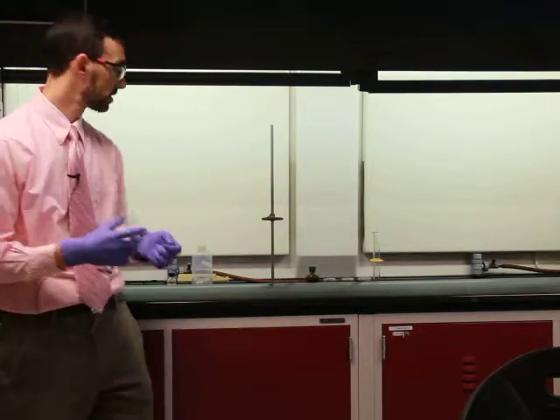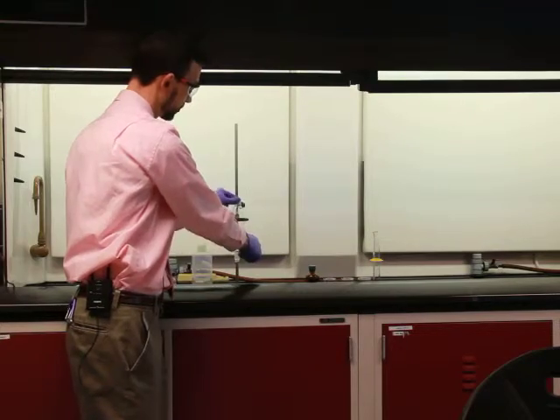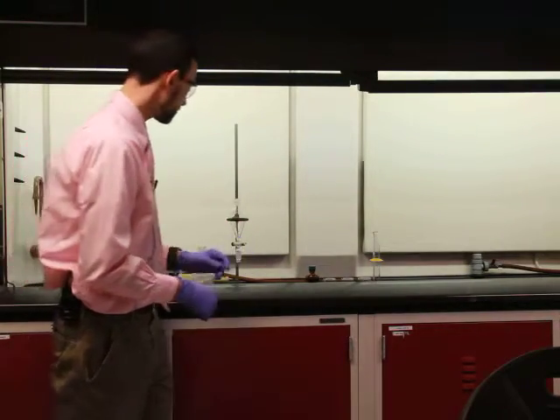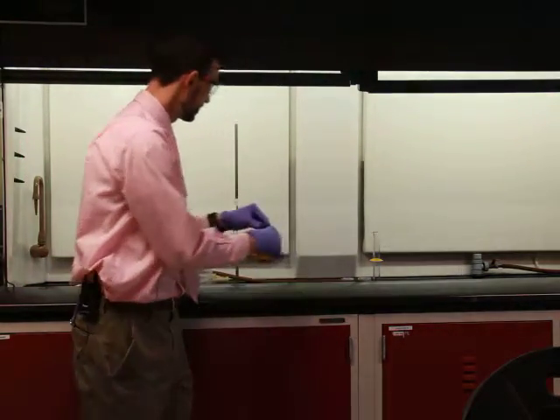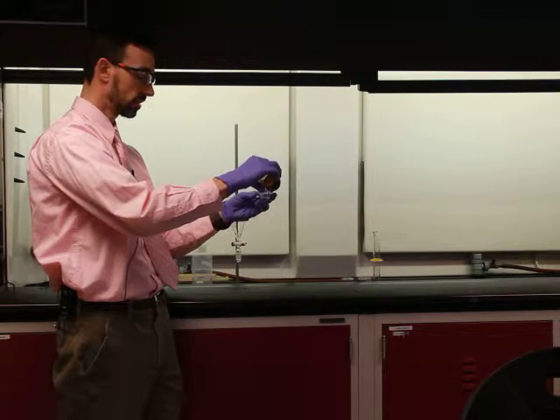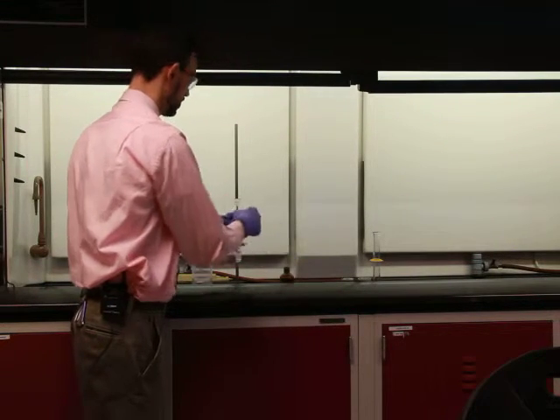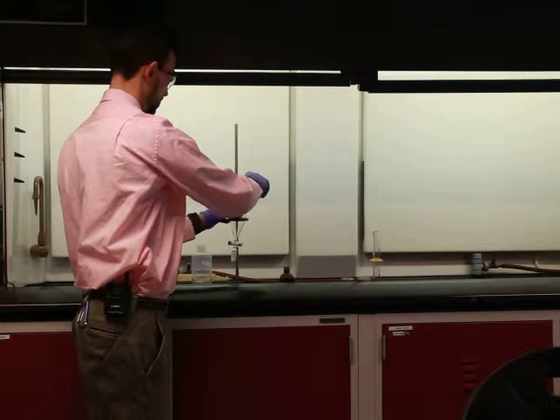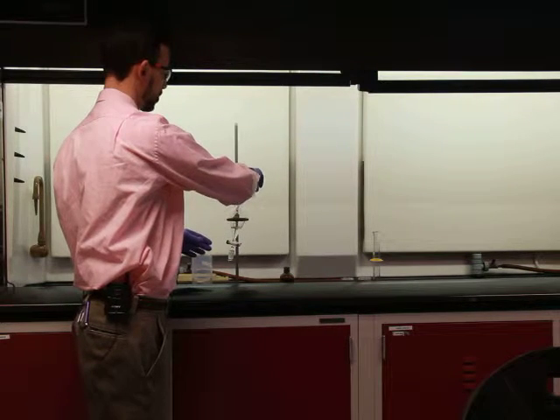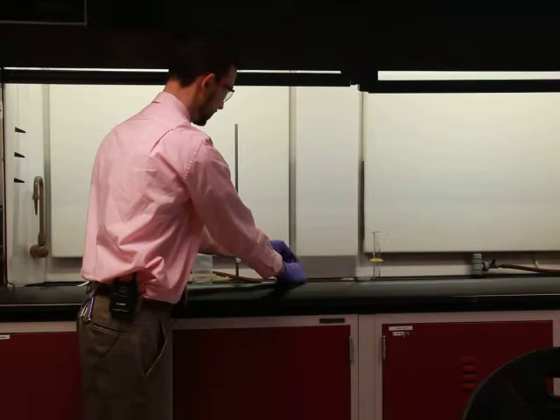All right. So the way this would work is what we would have done in the lab today is we would have started with our separatory funnel, and we would have added some ether into the separatory funnel. Okay. So I'll use about 20 milliliters of ether or so, ought to be enough. The ether has a very strong odor to it. The hoods would definitely be on if we were all working with this.